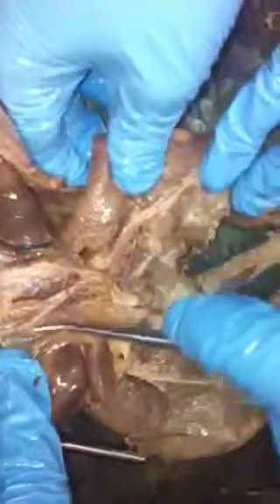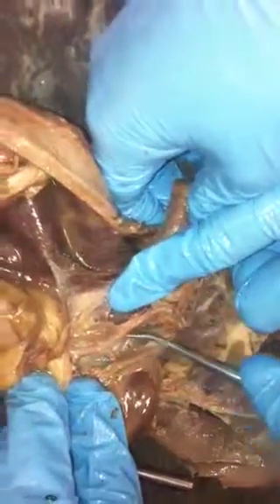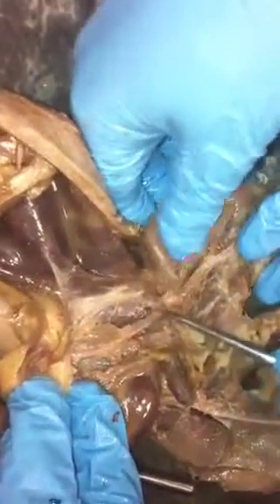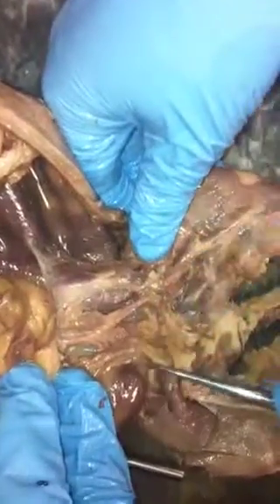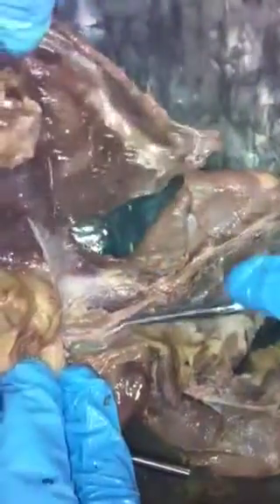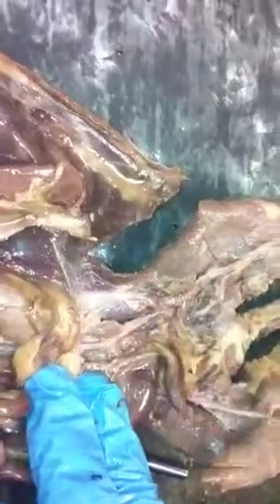Okay, then we're coming over here, and we see that this is the artery, which branches common iliac, right here. It's the aorta. Common iliac going to the external iliac. This is internal iliac, right here. This branch right here is also common iliac. And then when it branches, it's going to be internal iliac. Okay, you can stop. That's it.